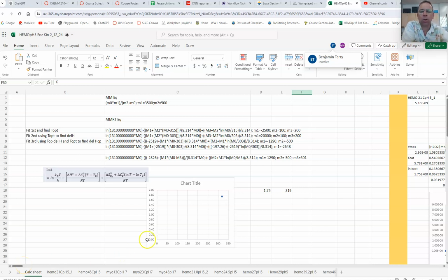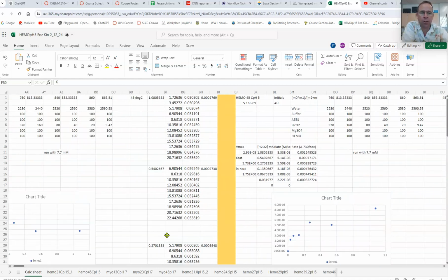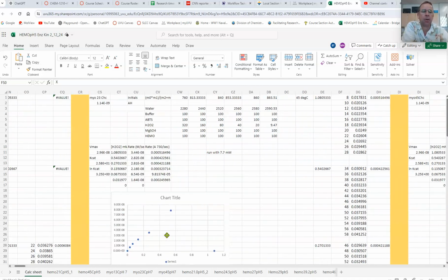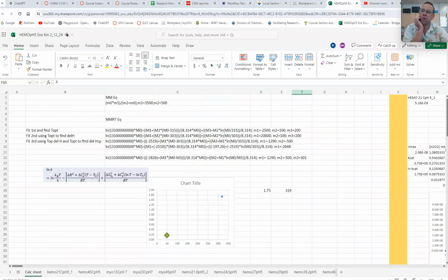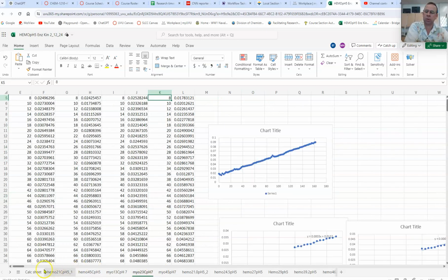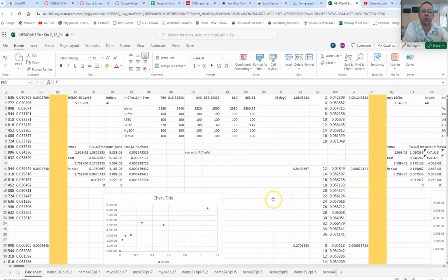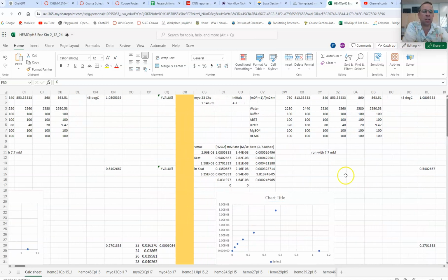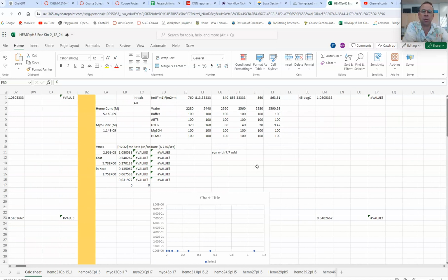All right, so to insert the data to begin the first analysis step, what we need to do is go into this spreadsheet here where the data is. We have our calculation sheet. We're going to be putting data that the students have acquired into certain spots in the calculation sheet. Each of these sections, separated by these orange lines, is where the data is going to be accumulated.